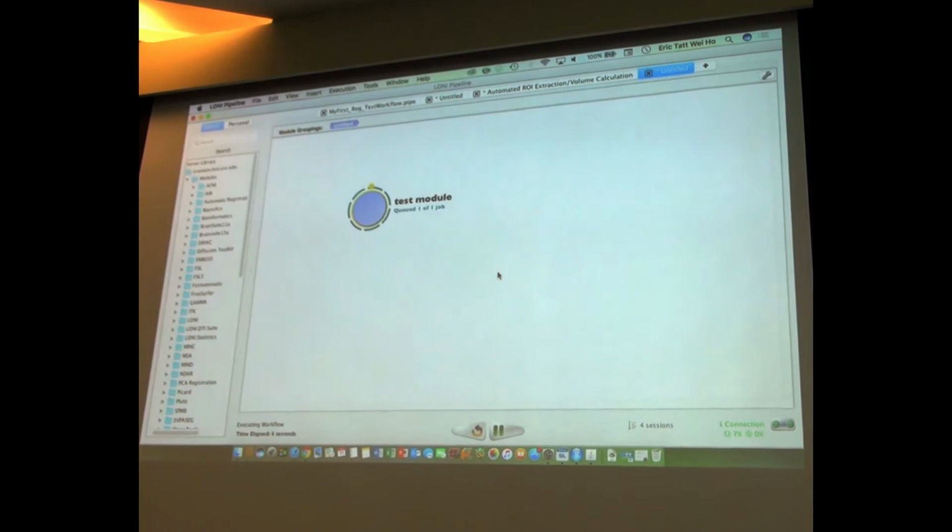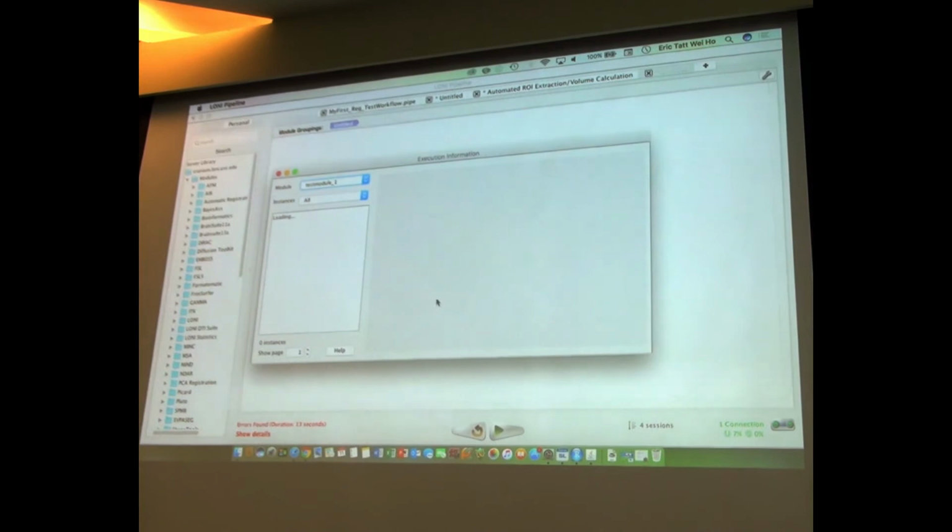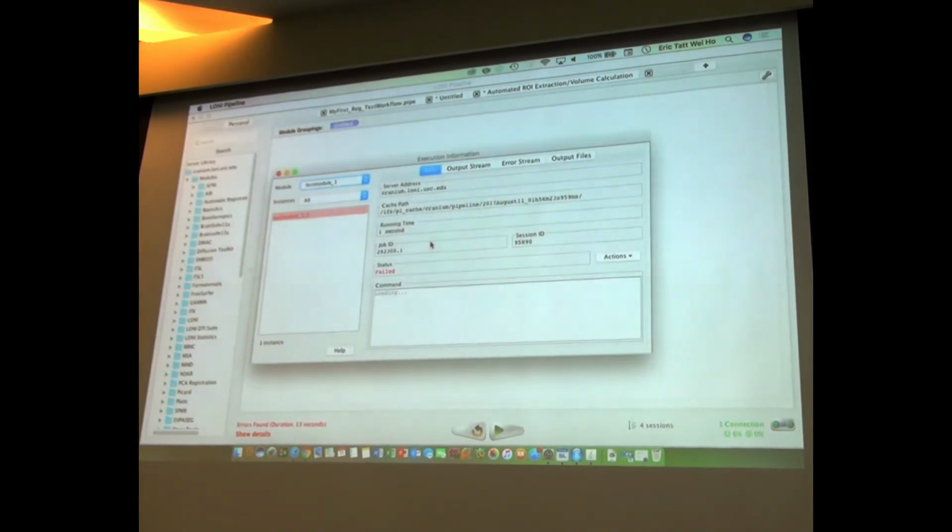All right, so again, what I'm doing here is I'm defining a very silly module that reads in from my local system a file, sends it to the remote server, reads the file and shows me the content of the file. So here is the invocation. Oh, it's not a -i. I'm sorry. I should change the flag.